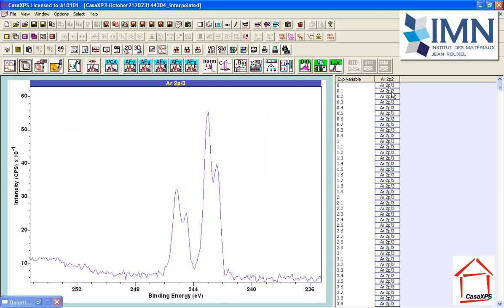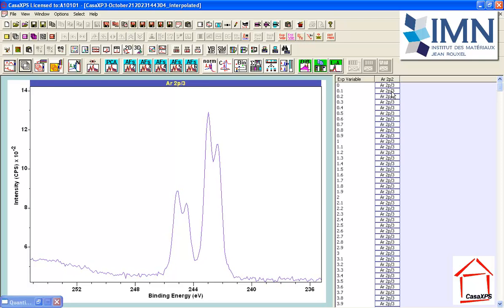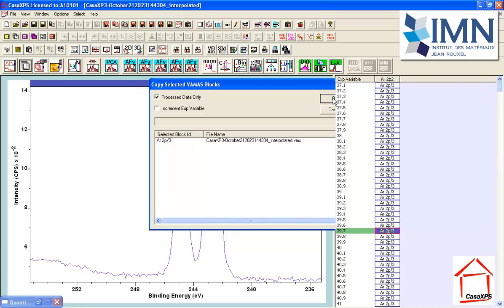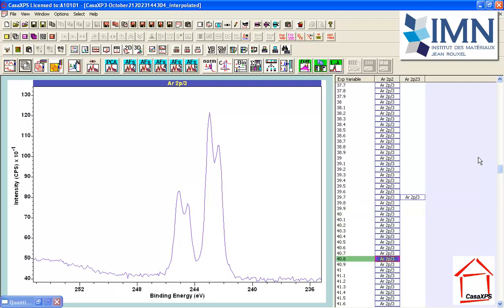So I'm going to go back up and generally look at the shapes of peaks, because I expect them to be Gaussian-Lorentzian type peaks. So I'm willing to accept that the spectrum that I'm looking at now, and it will be highlighted somewhere in this list, there it is, I can take a copy of that, take the copy to the next column over, and let's see that it's there. Yes, that's the copy. I use the arrow key, move across, and then I can go down the list once again and look for the alternative different spectrum.